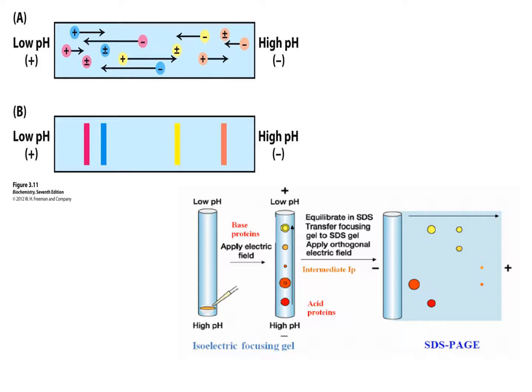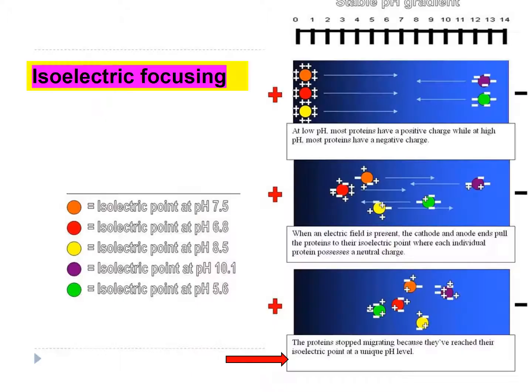And so here we are, we apply this to an SDS-PAGE, the second dimension, and separate. So notice this yellow band. It's not one protein, it's 2. One's big, one's small. And so this one here shows a very large protein and a small protein. So you can see the idea now. We're separating in one dimension and then separating in the other. And so you end up getting spots that can be further analyzed.